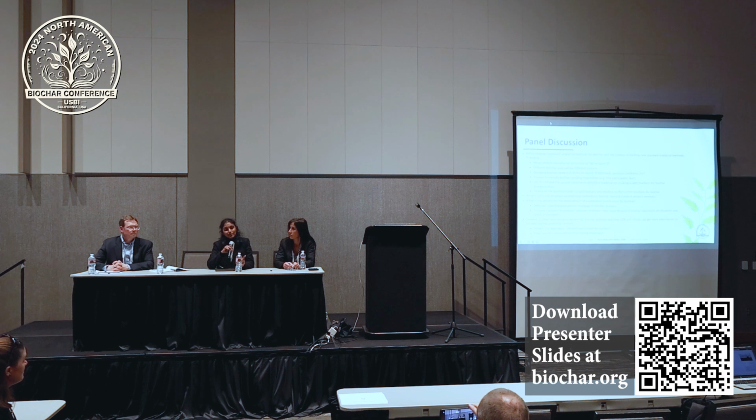And I have a point regarding the germination inhibition assay, because we do it quite a lot. We personally think that's a very important assay, because there are quite a lot of biochars where the physical and chemical properties are all good, but the germination inhibition assay shows something is off, because we don't measure everything in the labs. We measure what we know.